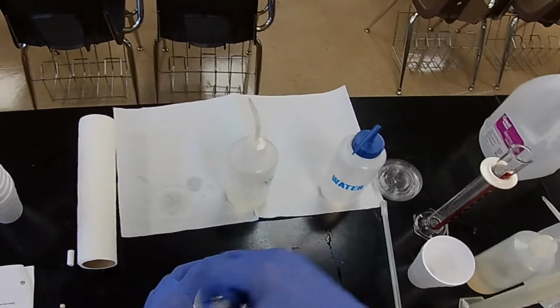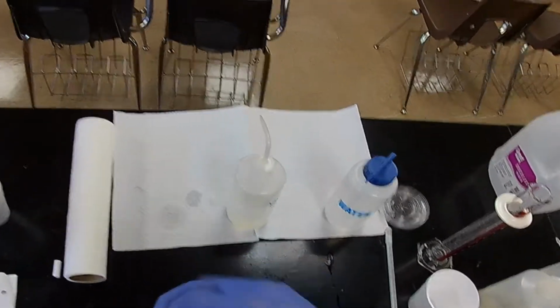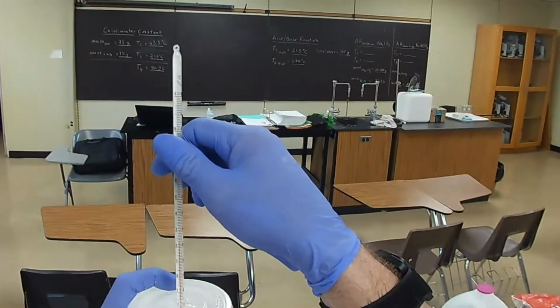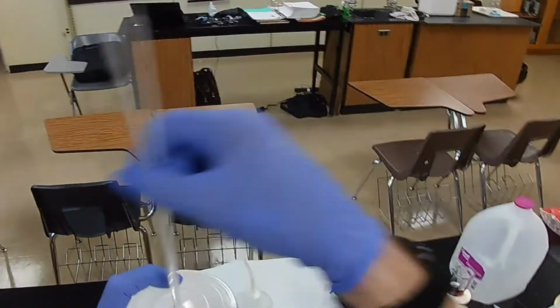All right. Now let's mix it up real good. Get it dissolved. Temperature's still on its way up.